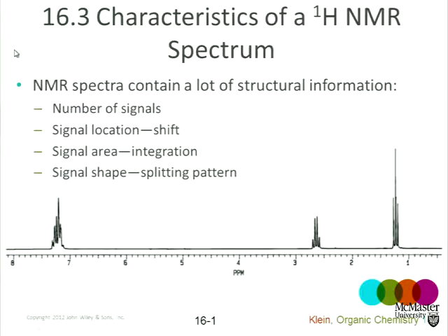On Thursday, we will see why these peaks, there's 3 equivalent hydrogens here at 1.2 ppm. Why is that peak split into 3? And that's a result of the so-called splitting pattern. It's a result of coupling between those protons and hydrogens on a carbon next door. So we'll see how a single line means that we have protons on a carbon with no neighboring hydrogens. Double line, 1 neighboring hydrogen. 3 lines, as shown here. This CH3 group has got 2 neighbors. Okay? And there they are. There's the CH2. It's 4 lines.